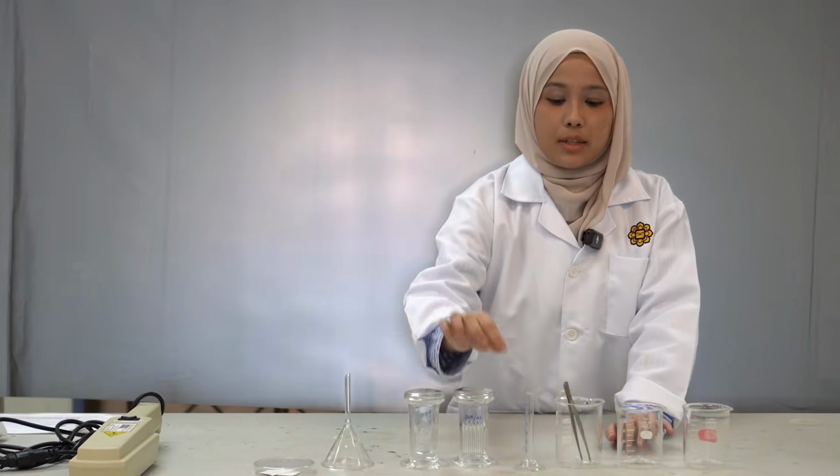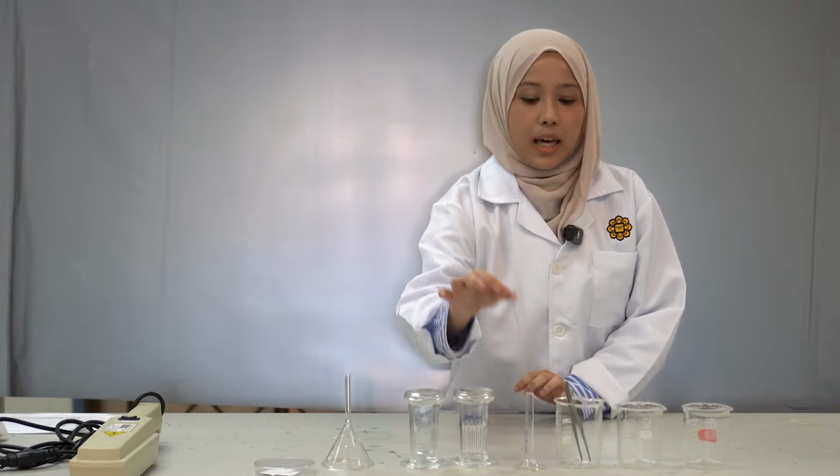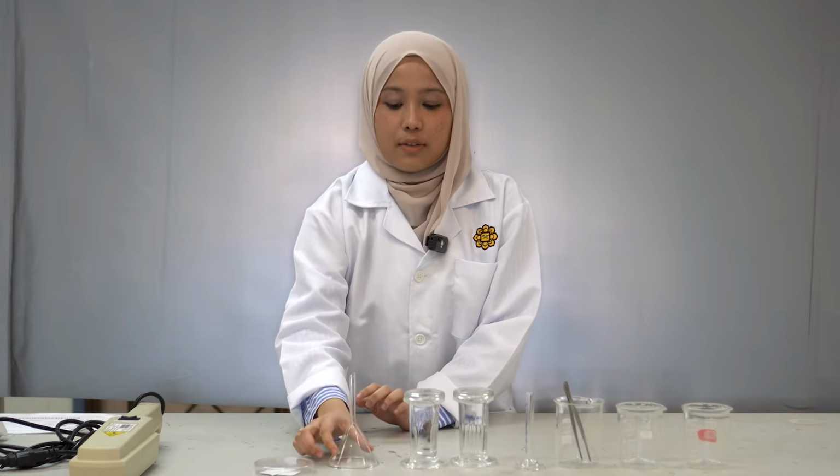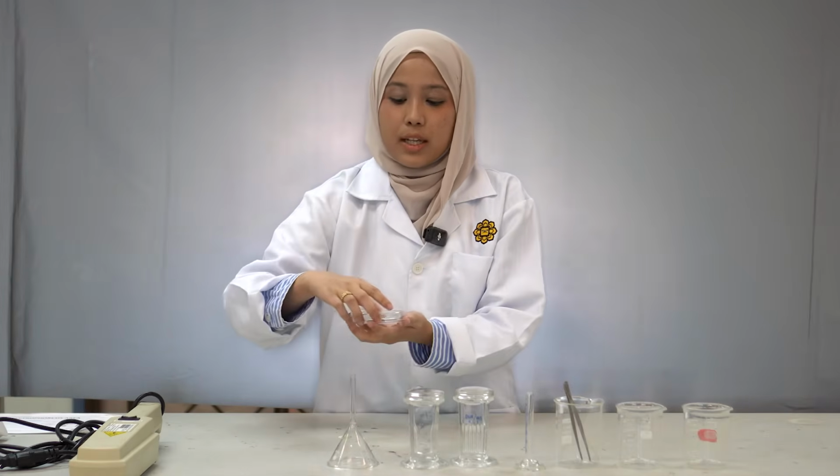Next, I'll be demonstrating the experiment. Before we start, I'll introduce the equipment that we need first. We will need a beaker, forceps, a measuring cylinder, a capillary tube, two developing chambers and also a filter funnel, and lastly, the most important part, a TLC plate.